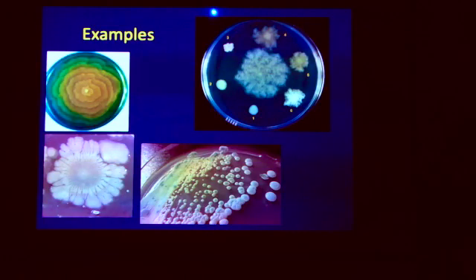All of these individual characteristics can be useful to you when you are looking at bacterial cultures, especially if you are looking at bacterial cultures that you have to be able to identify. If you can get isolated bacteria, make a pure culture plate and get individual colonies, and basically write down the characteristics for that particular bacteria.